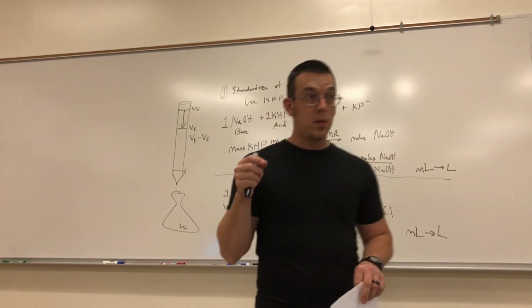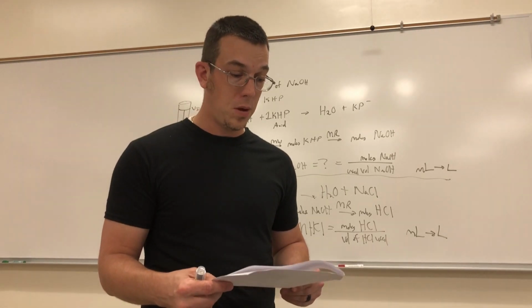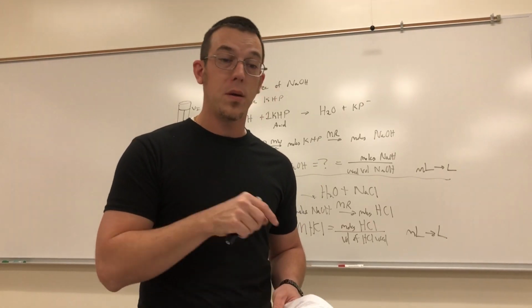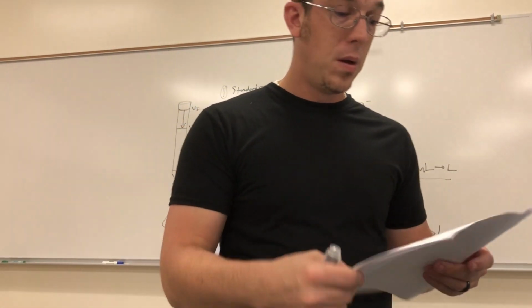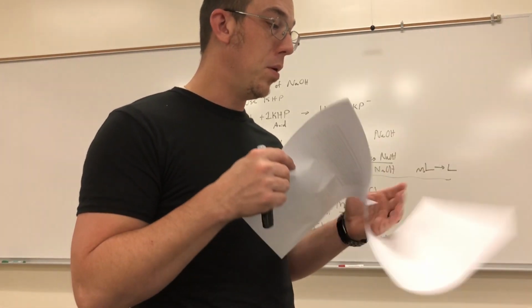Now that being said, I want you guys to use the data that I provided on Moodle, and I want you to determine the molarity of NaOH by the standardization process, and then also determine the molarity of the HCl. If you notice that in the paper it says molarity of acetic acid, cross off acetic acid and write HCl in place of that. There are also those post-lab questions that you'll need to complete. So make sure you complete both those pages.